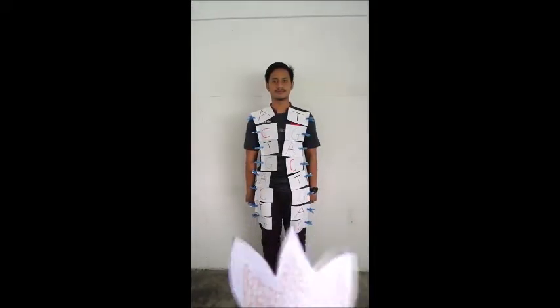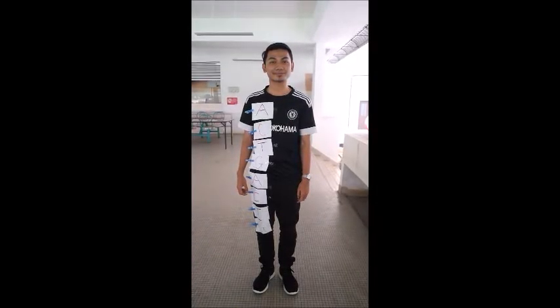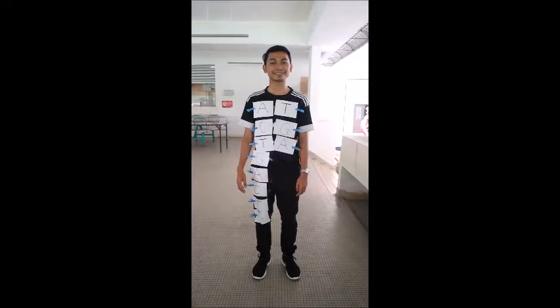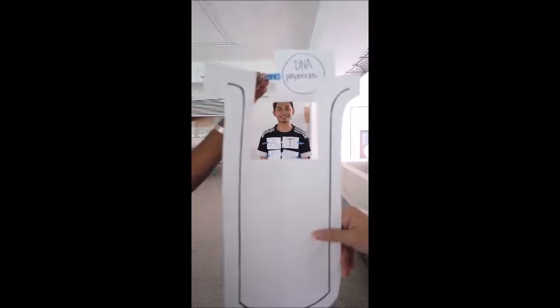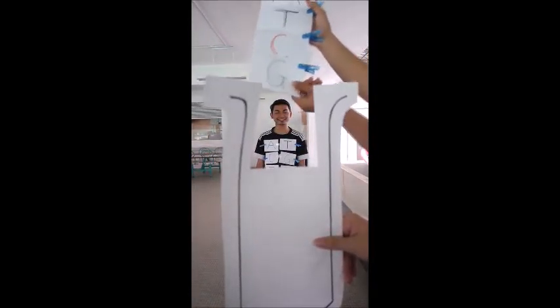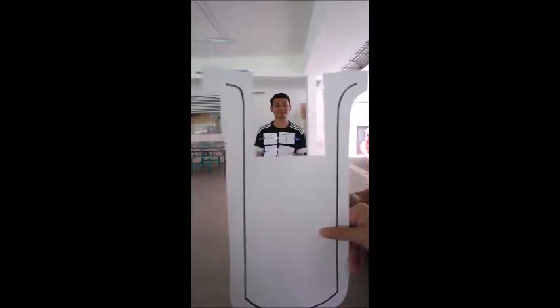First, we heat the strand. This is the template strand. This is primer combined with template strand. Template strand is added to the test tube. After that, DNA polymerase is added into the test tube, followed by all other 4 bases of dNTP.